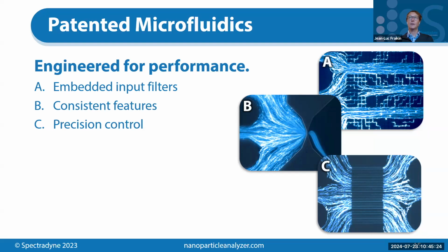And then we measured our detection limit, where the electrical noise floor is. And so what we found was that our detection limit for FITC, in units of FITC MESF, was about 20 to 25. And for PE, obviously PE is a much brighter fluorochrome, so it's in the range of a couple of fluorochromes. And I think the data that I showed today showed like 2.5 PE as the detection limit.